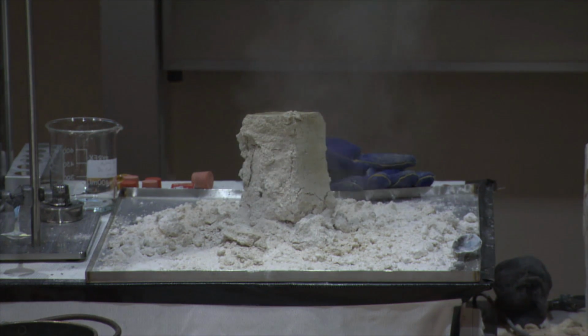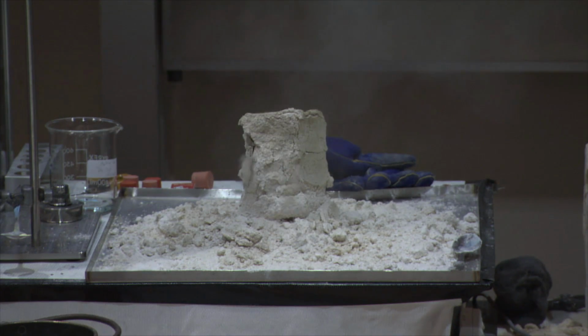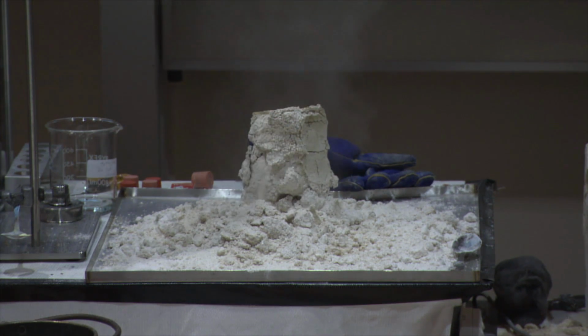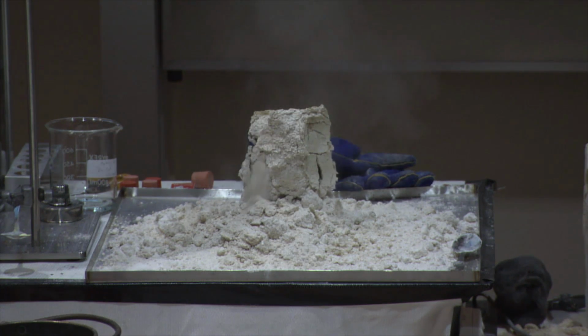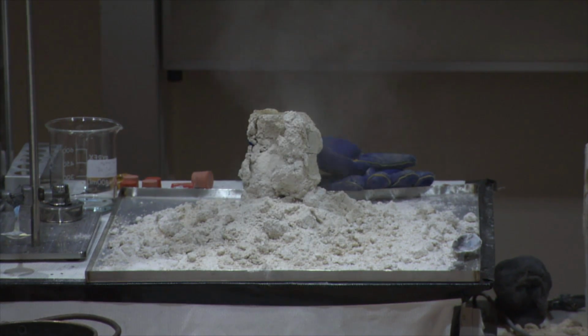So it looks like it's alive. It looks like it's changing and growing and changing over time. So this is why it's called quick lime. So this was limestone, this is quick lime. Quick there means, well, it means living, just like the quick of your fingernails, it's living tissue here. This quick lime is alive, it's reacting with the water.